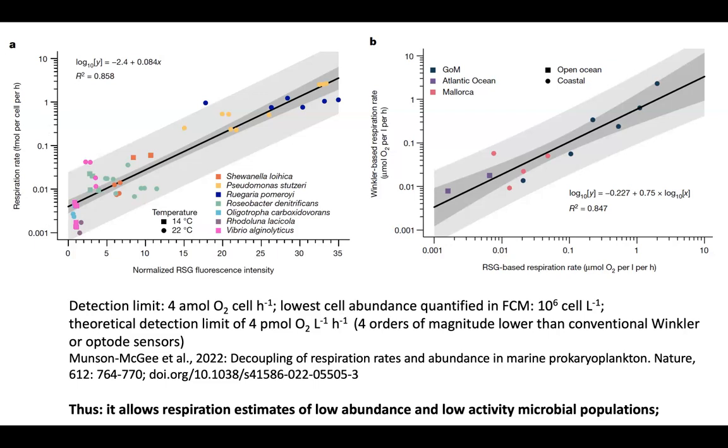And so over quite a range of 3-4 orders of magnitude, we did get quite a linear exponential relationship here, because this is a log scale here. So this was quite convincing, using these different bacterial strains.